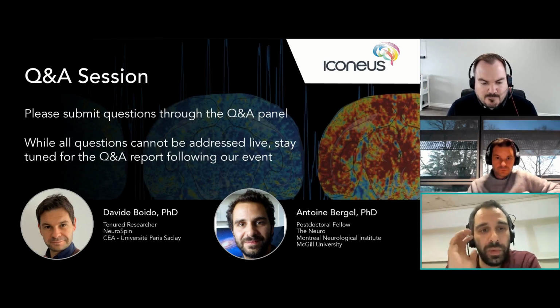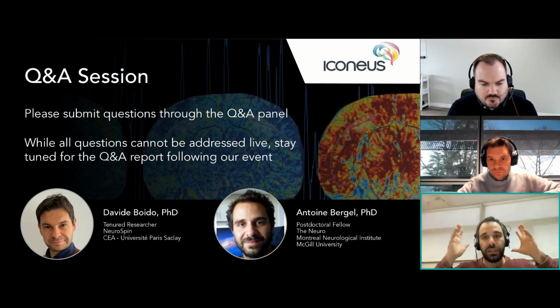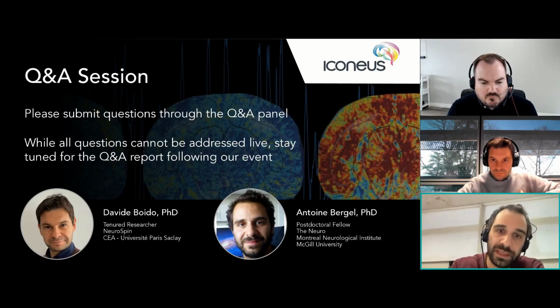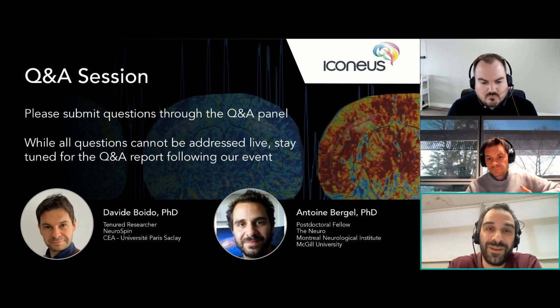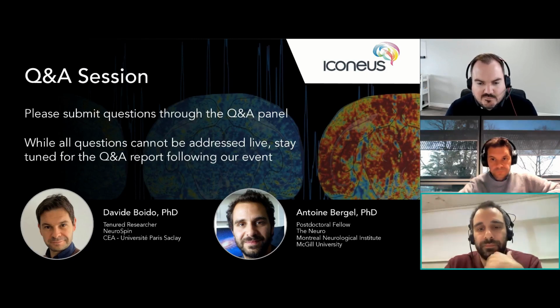Now, it's really also about the design. If you have anything that's too bulky, you increase the chances that the animal would scratch their head or bump into things and exert mechanical stress on the implant. So I think the design is important. The fact that the animals are well and do not feel that they want to scratch themselves too much will definitely increase, and you'll be able to keep your animals for way longer than if they're stressed. So it's something that's definitely a bit overlooked in neuroscience because it requires time, but it's definitely worth investing the time to do this. Okay, fantastic.